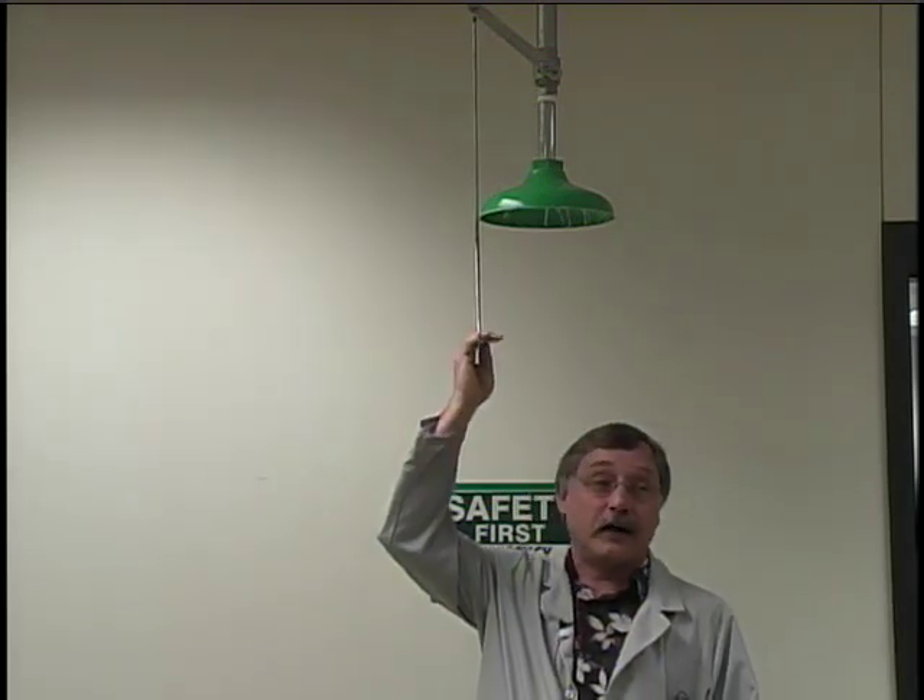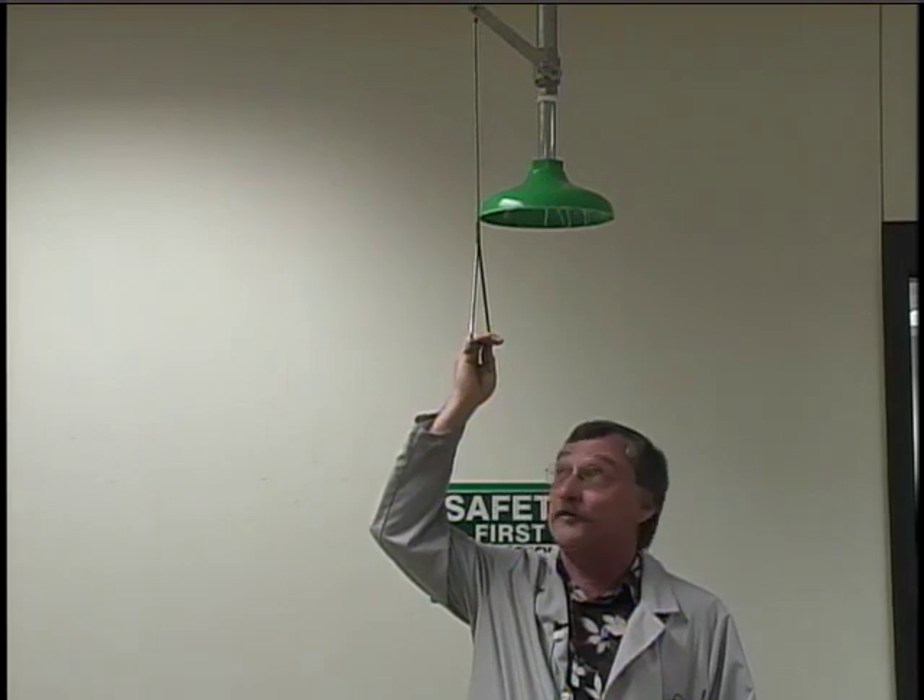Above the eyewash is the safety shower. You'd use this in case you spilled some hazardous chemical on your body. The first treatment for almost any chemical on the skin is to flush it with lots of water. To turn on the shower you simply pull down on this bar. If the chemical had soaked through any clothing, you need to remove the affected clothing so that the shower can actually wash the chemical off of the skin.